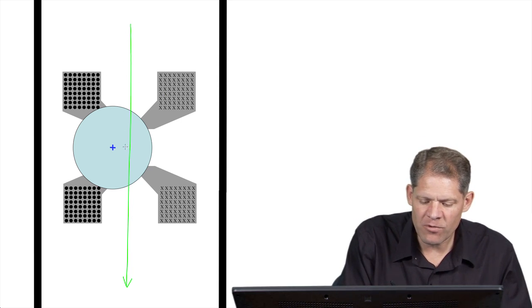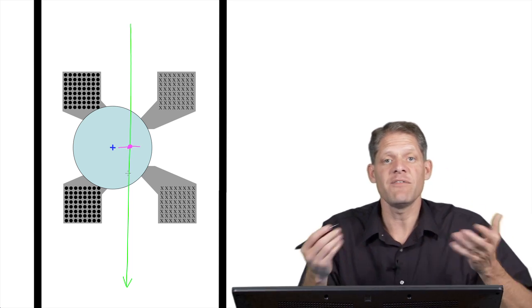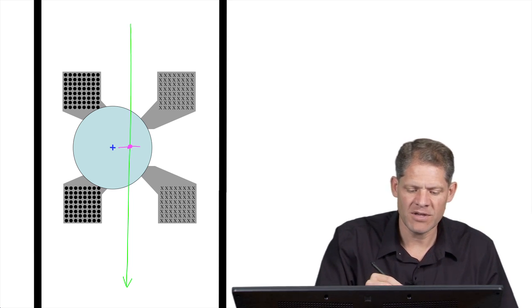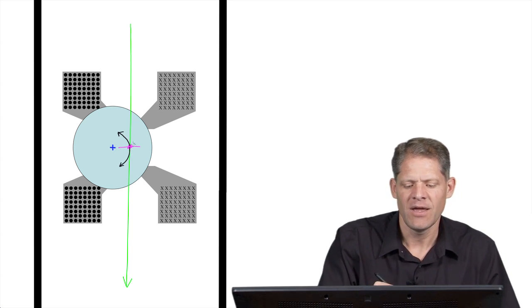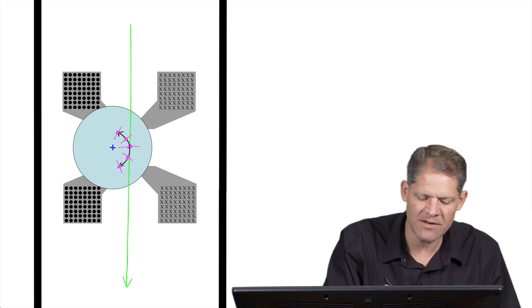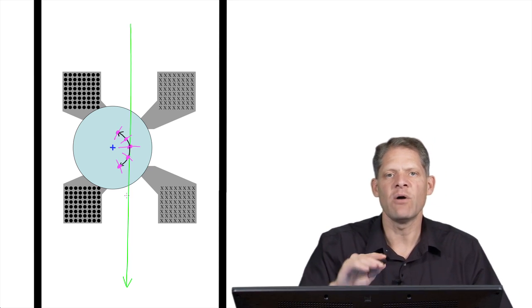And because of that, if we were looking at a sample, we would have the sample moved over here so that it was under the beam. Obviously, if you're looking at a target, it has to be underneath the electron beam. So it'll be in this position over here. And that's a problem, because now when you rotate the sample, it's going to go through a trajectory like this around the axis of the goniometer, and your sample, as we rotate it, will end up moving, say in that way, and in negative tilt angles down this way. And so now our target is moving underneath the beam while we tilt it.